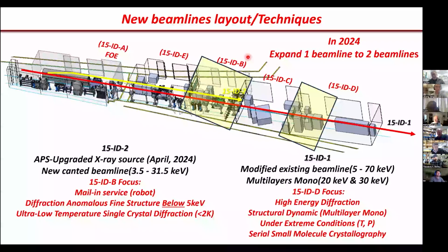Crystals come here, and in that case, if somebody wants to do, for example, a heating temperature study, then we can group together and everybody gets a nice data set back for what they need.